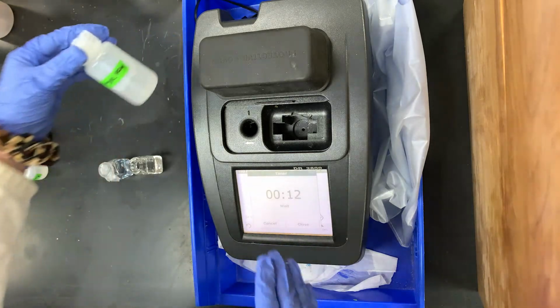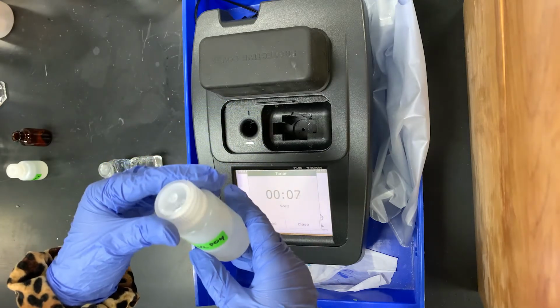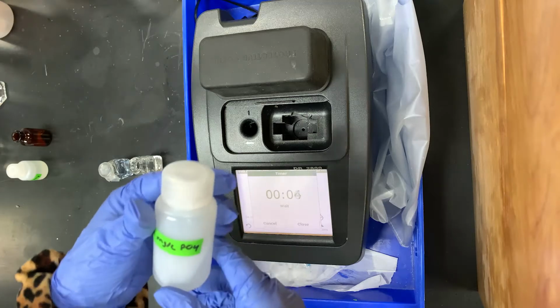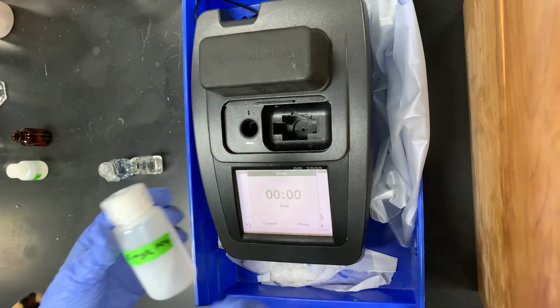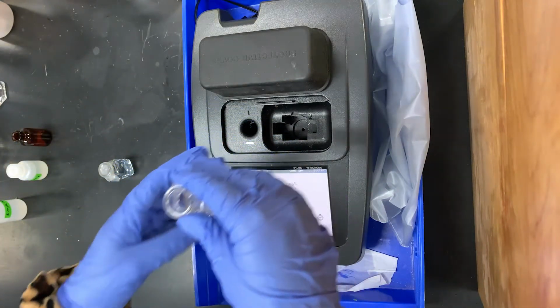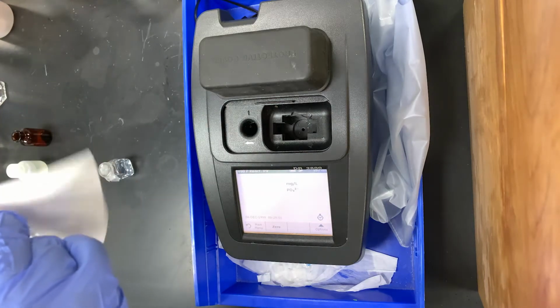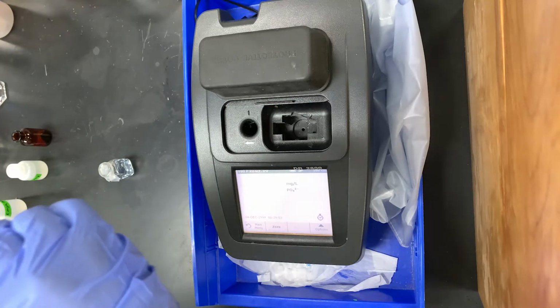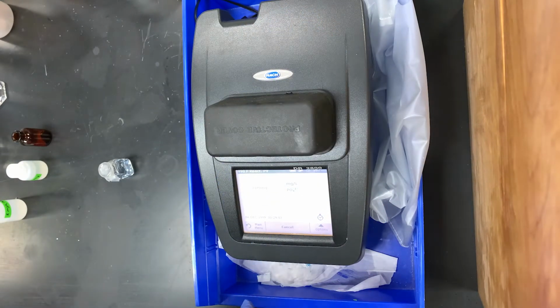Our time is almost up for the 2-minute reaction, and again we are doing this part to verify that the 1 milligram per liter phosphate solution we made is actually 1 milligram per liter. This is always good to do for any solution that you're making, just to double check that you've made the right concentration. So again we have our blank, which is just 10 mils of our sample with no reagent in it. As always, give your cuvette a good wipe down with a chem wipe and place it inside the spectrophotometer. Then close it and press 0.